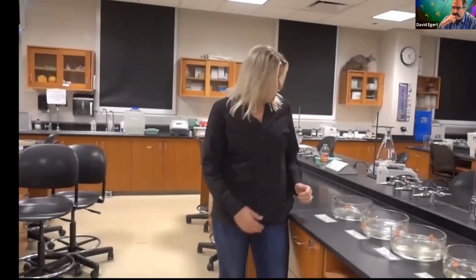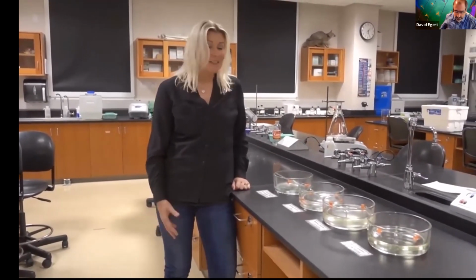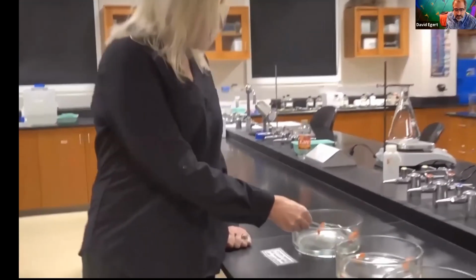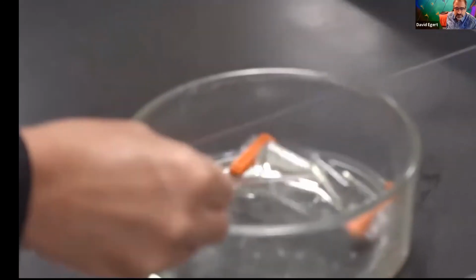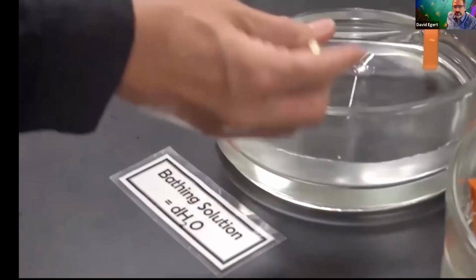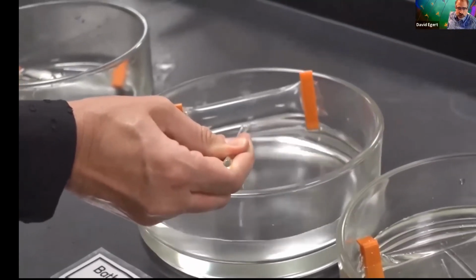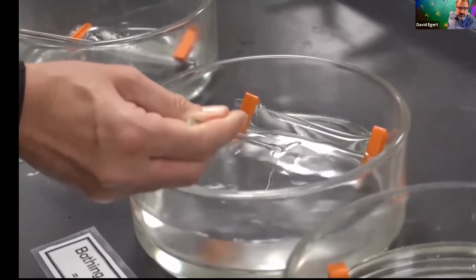All right, so we're back at our sausages here made out of dialysis tube, and it's been an hour. Just to check on these, here's our control. You can see it's kind of this consistency here. I can lift it, a little bit of bending. We filled it with sucrose solution. This has been in distilled water, and if I push on it and also lift it, you can see it's very rigid. So this one has taken in water and got quite taut and rigid.